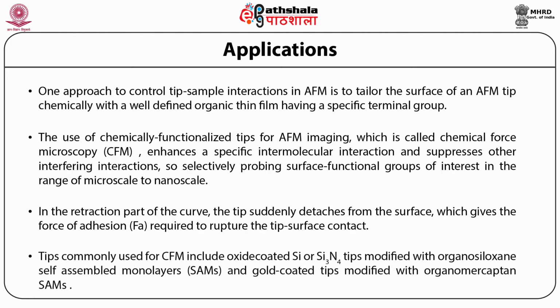Tips commonly used for CFM include oxide-coated silicon tips modified with organosilane self-assembled monolayers, and gold-coated tips modified with organomercaptan.